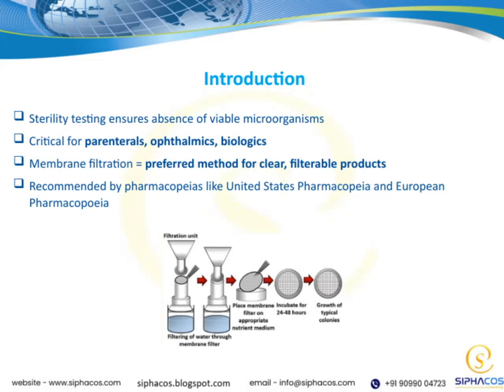Let's begin with the concept of sterility testing. This is a crucial process that ensures products are free from viable microorganisms, which is essential for patient safety. It's especially critical for products like parenterals, ophthalmics, and biologics, where the risk of infection must be minimized. One of the key methods used in sterility testing is membrane filtration. This technique is preferred, particularly for clear and filterable products, because it allows us to effectively trap any microorganisms on a membrane for easy detection.